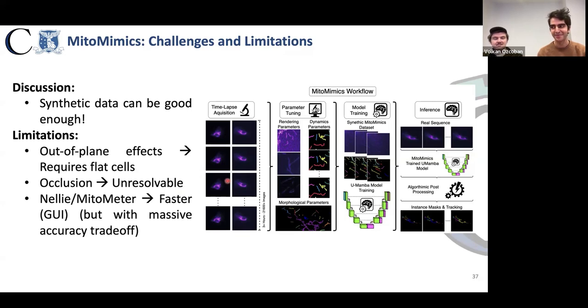I'm sure we'd need many people doing this day and night just to get this level of segmentation. And so we believe that this approach could extend to many other microscopy and biological imaging applications where image characteristics and morphology are sufficiently well understood or can be closely approximated to realistically simulate those.